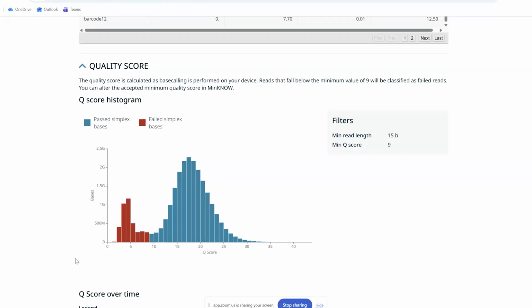Yeah, I feel like I would keep it with the default settings for this first pass QC. There's no reason for you to use anything below the 9 or the 10, depending on the base calling model you're using. You can safely discard that data. Let me think if there's anything else. Some groups go lower, even than 9 or 10 for the SUP base calling model.